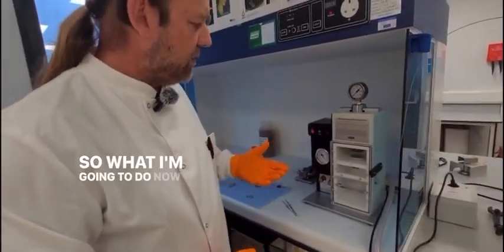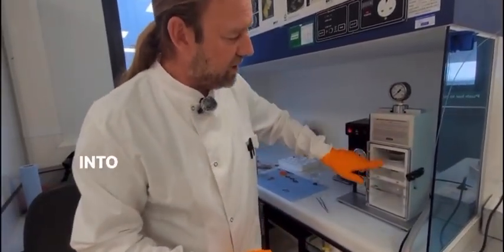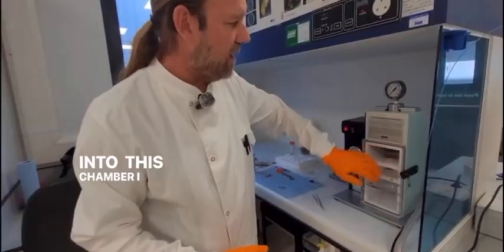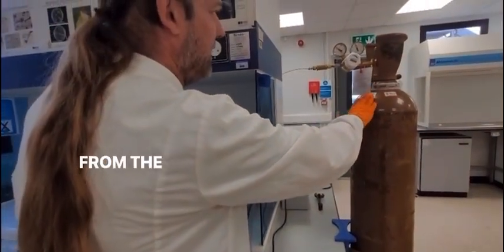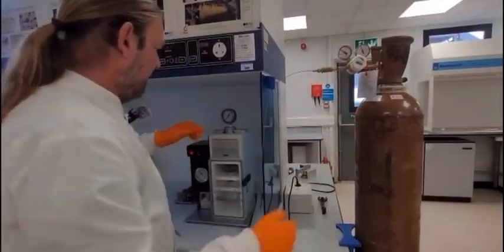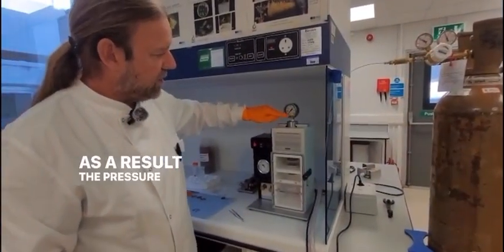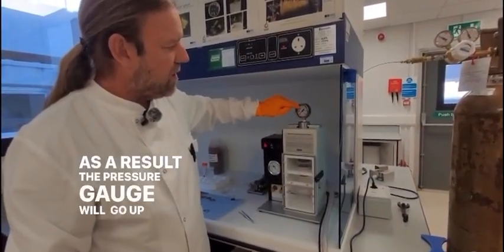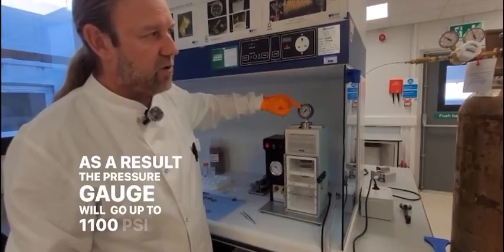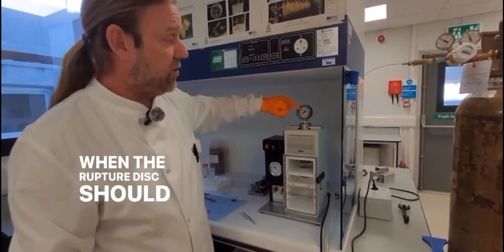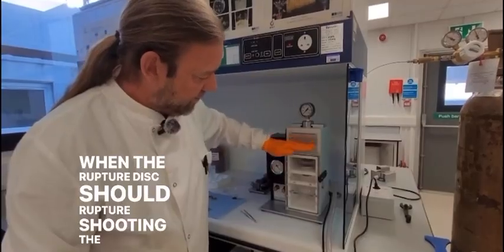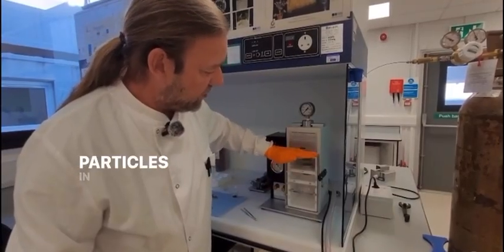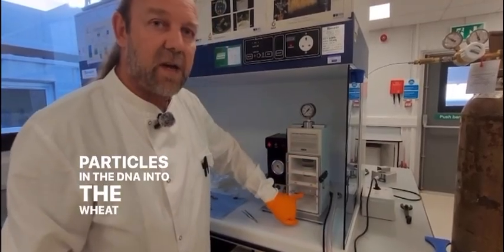So what I'm going to do now is I'm going to draw a vacuum into this chamber. I will then start to build up pressure from the helium tank here. The pressure gauge will go up and at 1100 psi, the rupture disc should rupture, shooting the gold particles and the DNA into the wheat embryos.